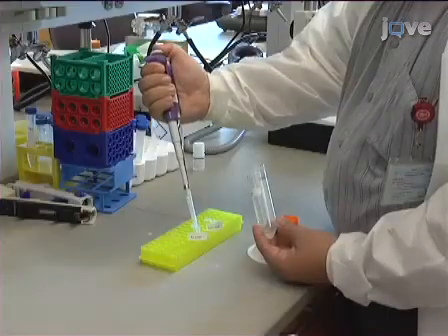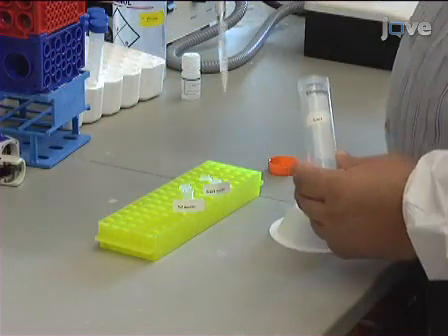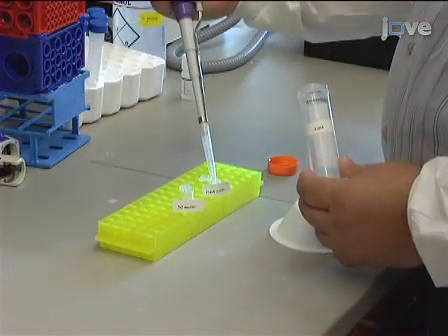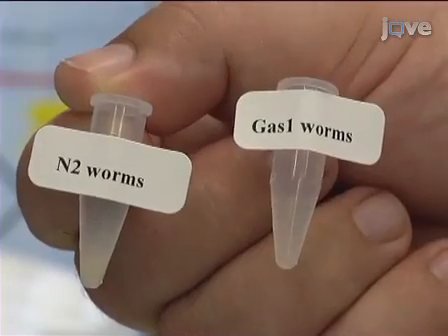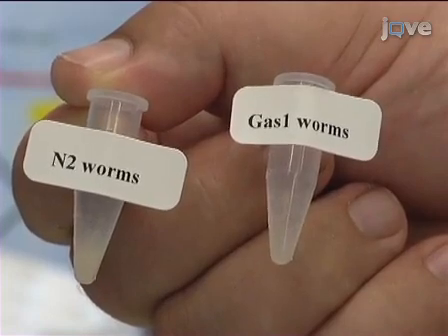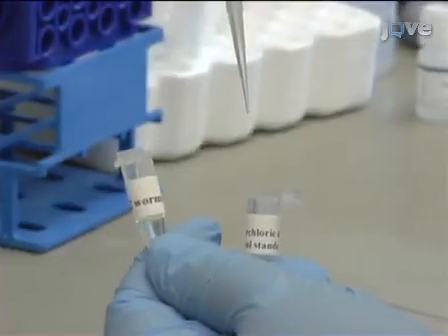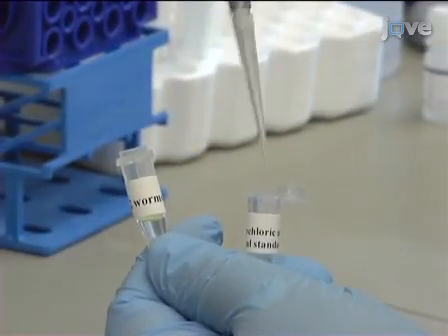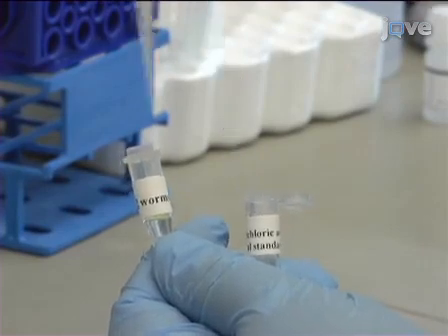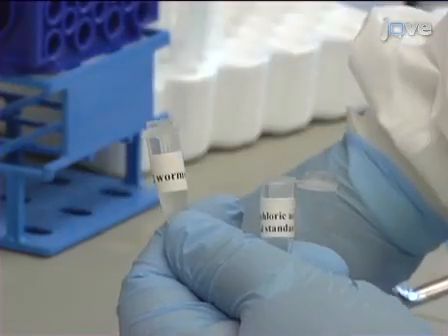To begin this procedure, worms that have been exposed to a stable isotope-labeled metabolic precursor, either during development or in adulthood, are collected in a 1.5 milliliter plastic centrifuge tube. We usually dilute the worms to a concentration of 1,000 worms per 1 milliliter. Add 60% perchloric acid containing epsilon aminocaproic acid as an internal standard to the worms to a final concentration of 4% perchloric acid and 20 nanomolar of internal standard.